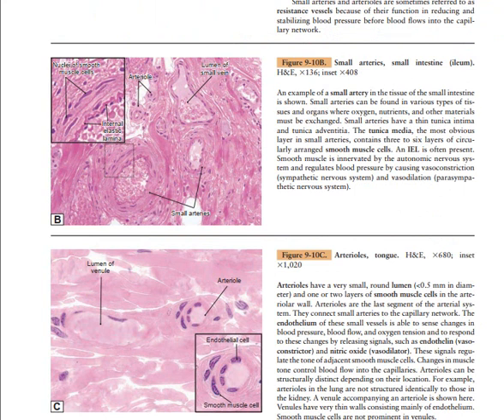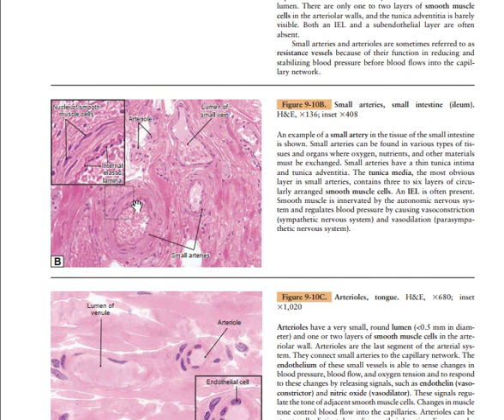Now these are the small arteries of the small intestine. The lumen is not going to be regular here, so this one is more of a vein than an artery. This is an arteriole. Arterioles are quite smaller than these small arteries. Is it clear?